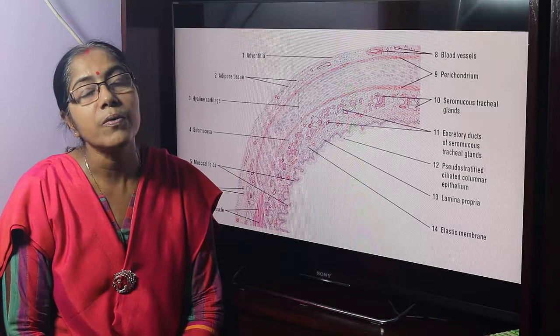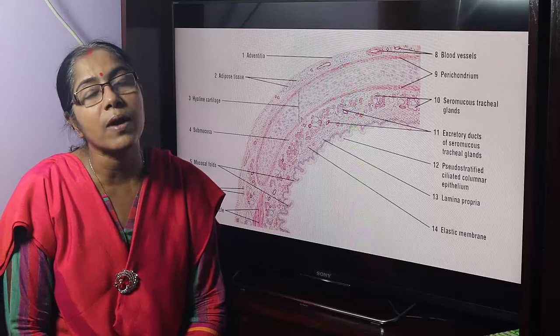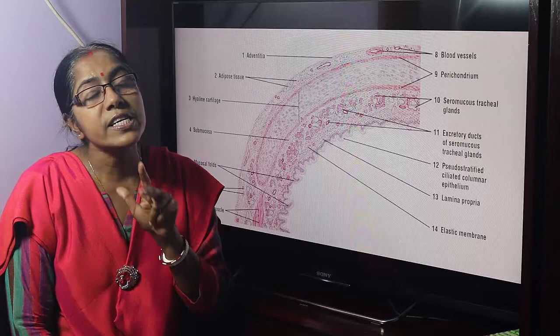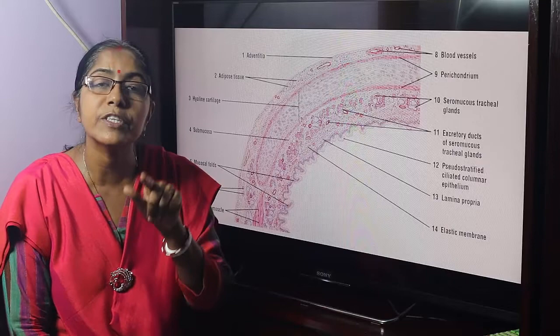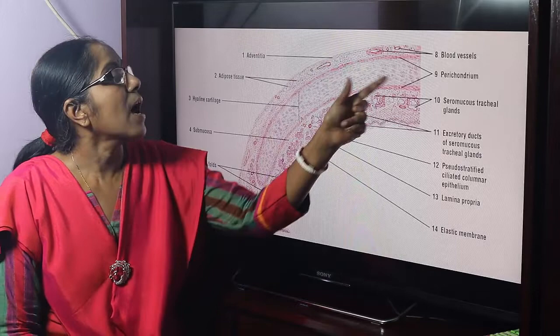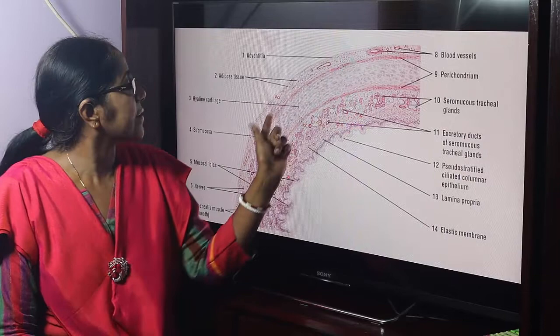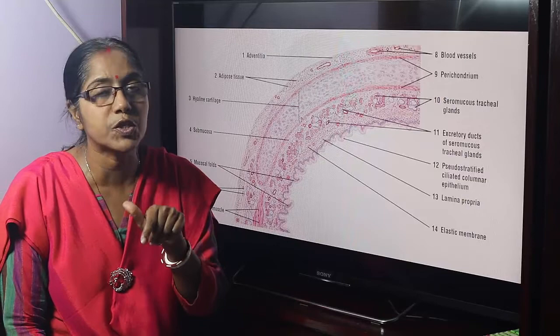What is trachea? Trachea is a fibrocartilaginous tube lined with mucosa. Trachea is composed of 16 to 20 C-shaped hyaline cartilage. This is the hyaline cartilage. Our identifying point is that the core of the tissue is formed by the hyaline cartilage, and the cartilage is covered with perichondrium. Perichondrium is a dense connective tissue.